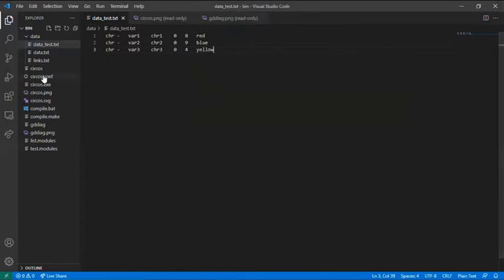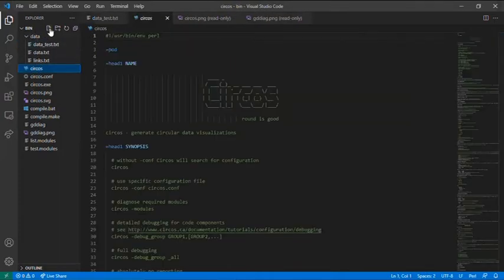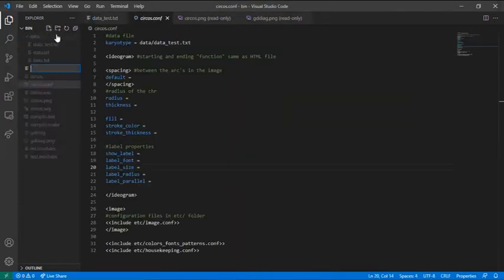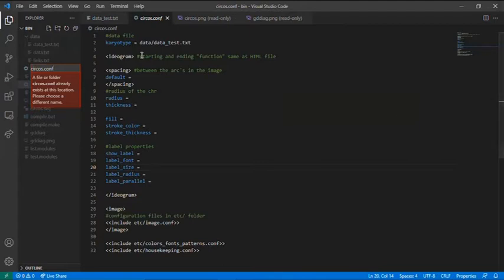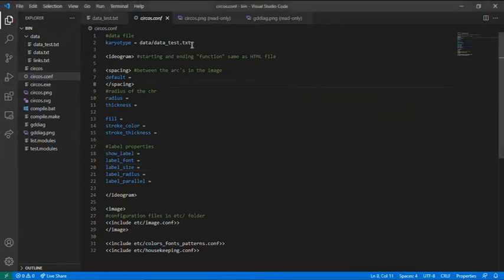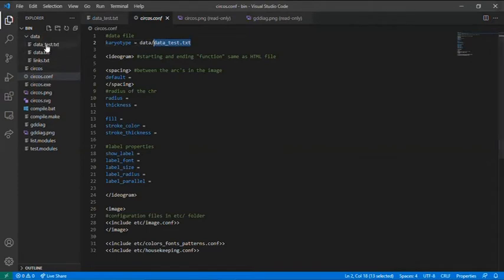Now you need to create the configuration file, not on the data file, but on the bin folder. You just come to here again and press new file and write Circos.configuration. And just press enter. But I will leave this configuration template with the video. The first thing you need to do is to give the computer where your data file is. As you can see it's in the data folder and it's called data.test file.